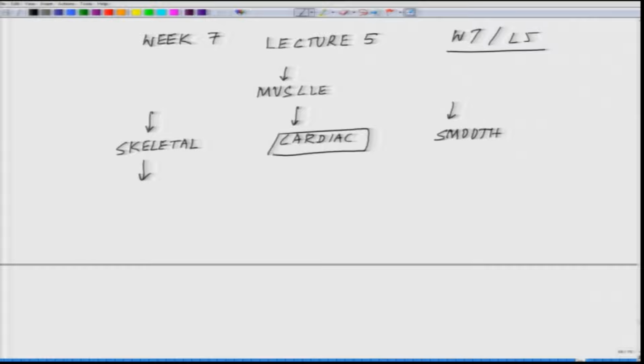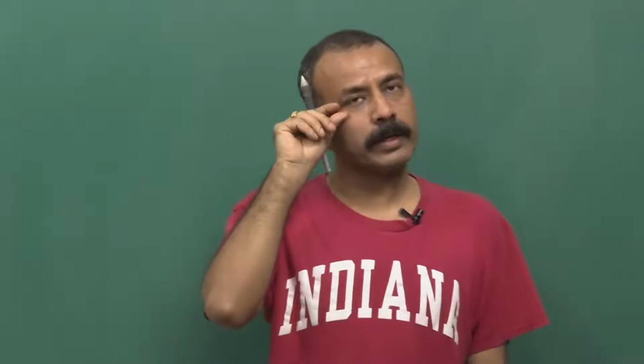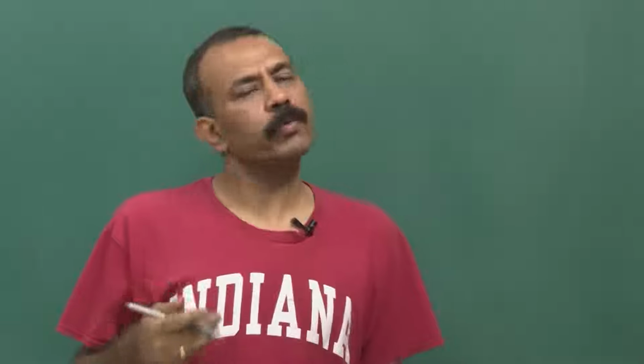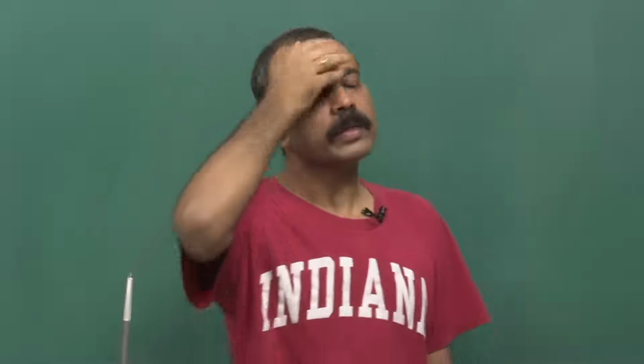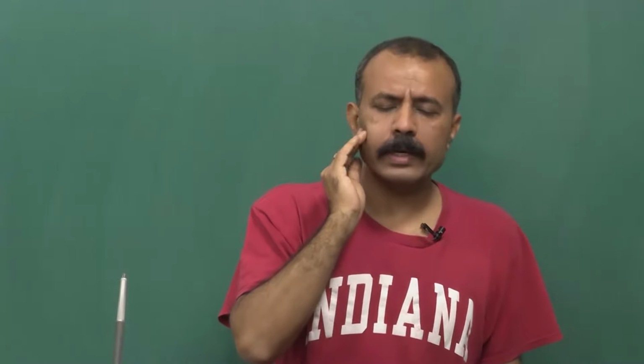So, today we will talk a little bit about the cardiac cells, because there are several people who are interested in growing cardiac tissue, and yet they are not really aware of where to start. There is one cardiac cell line, similarly to skeletal muscle, where there are C2, C12 cell lines.